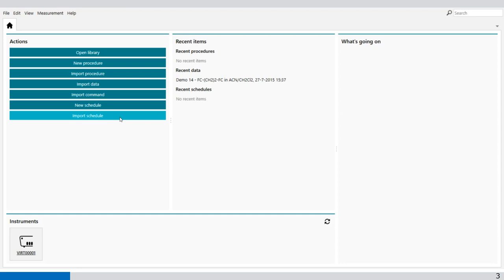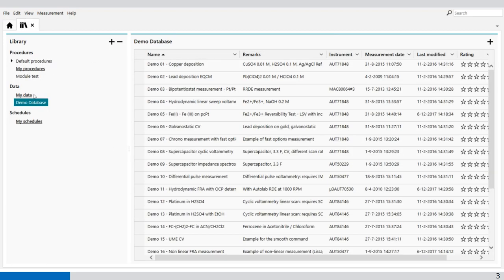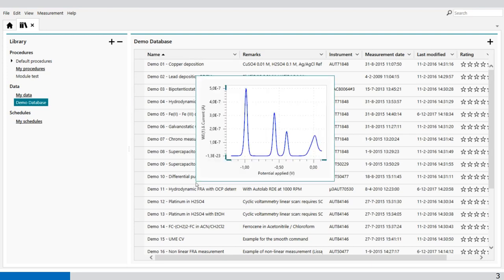Welcome to the Nova software. To illustrate the peak search command, I have to open a demo file. Go to open library, go to the demo database, and select demo 14.